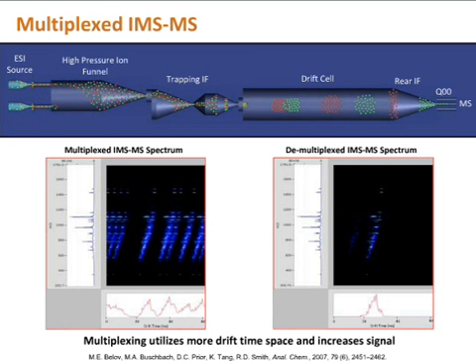By doing this, we can also demultiplex the ions into the correct drift time they should be. So if you pulse an ion in at time 0 and then at time 2 milliseconds, we know that the time 2 millisecond ion should have 2 milliseconds subtracted. And we follow all packets and then demultiplex them.